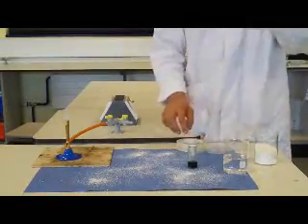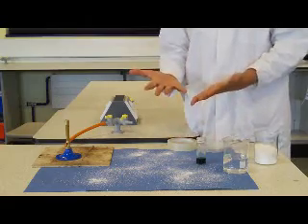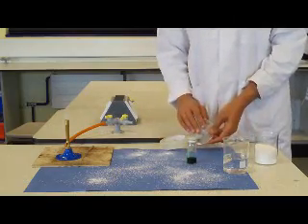By using the soap powder and the green dye, students can then assess whether they've managed to create aseptic conditions. They can look for contamination of green dye on themselves, on the surfaces, and whether any of the powder has got into the bottle or the agar dish.